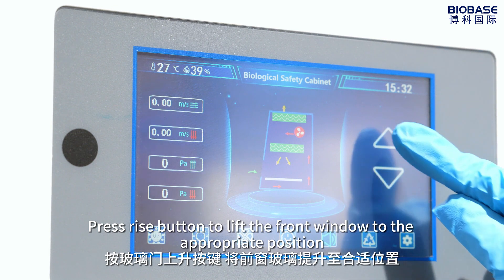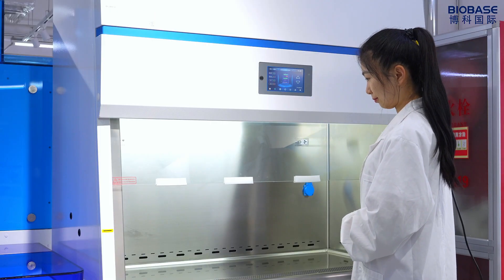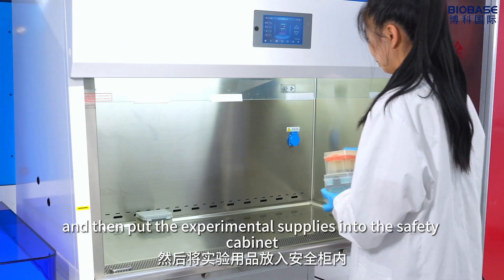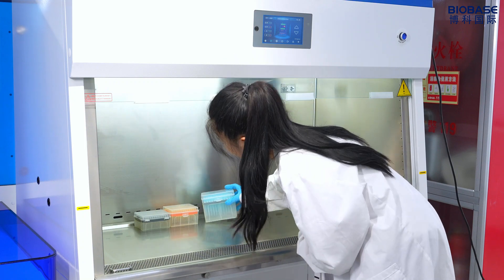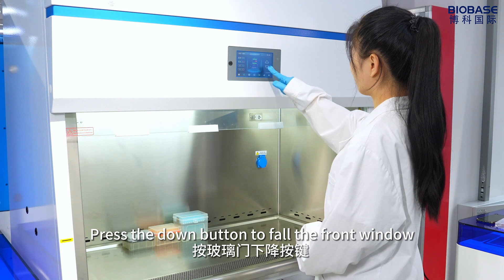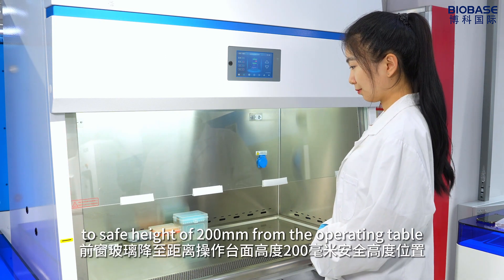Press the rise button to lift the front window to the appropriate position. Then put the experimental supplies into the safety cabinet. Press the down button to lower the front window to the safe height of 200mm from the operating table.